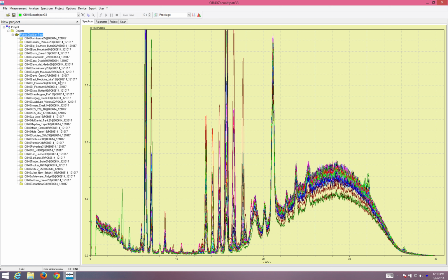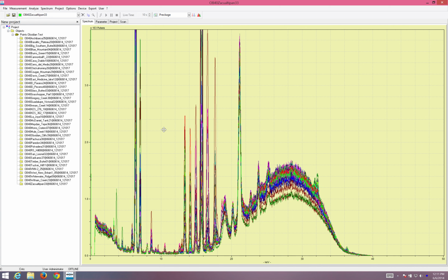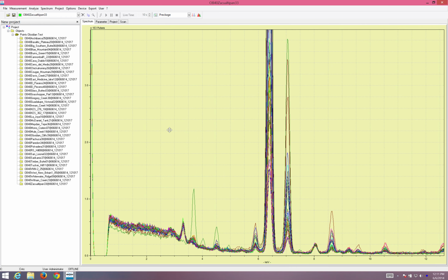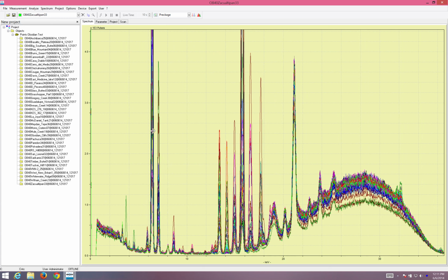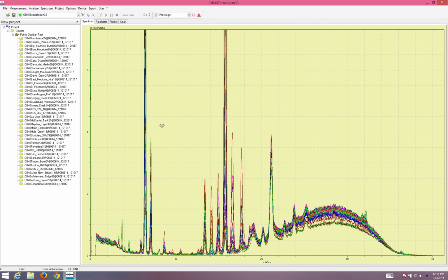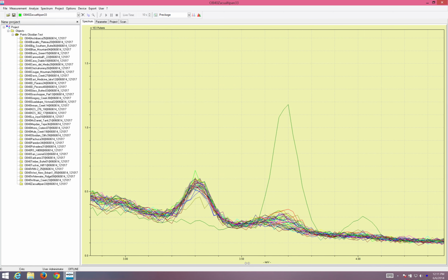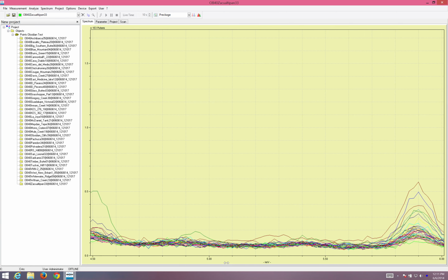Now, to manipulate my spectra, I need to press and hold the Control button. I do so, and when I click, I can now spread. And you see the arrow button changes to these 4 arrow buttons. I move left to right to expand left to right. I move up and down to expand up and down. If I zoom into a portion of the spectrum, I can then click below the x-axis to drag over to the right and then navigate peak by peak.